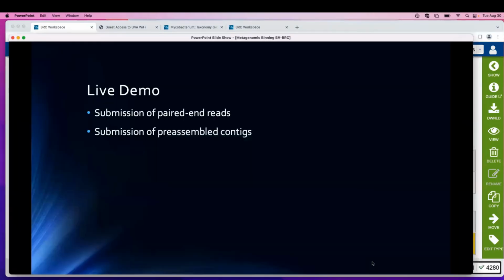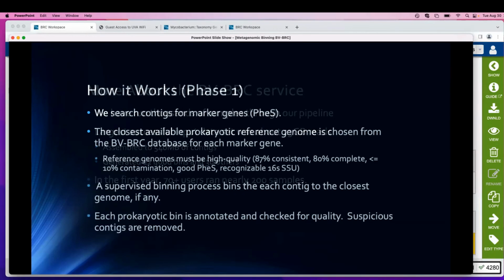Because we go back here, I also recall that I did mapping against that rickettsia felis genome, and the reads aligned to it, and then, as I recall, it came up. So Bob, maybe when we are showing BLAST or something, one of the exercises we can do is pull the PSSM from that particular gene and see. Yep. Actually, it might be there in the genome quality report also. Yeah, when I click through to that, we'll take a look and see.